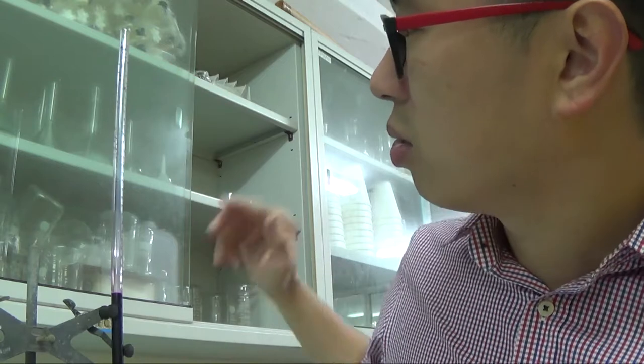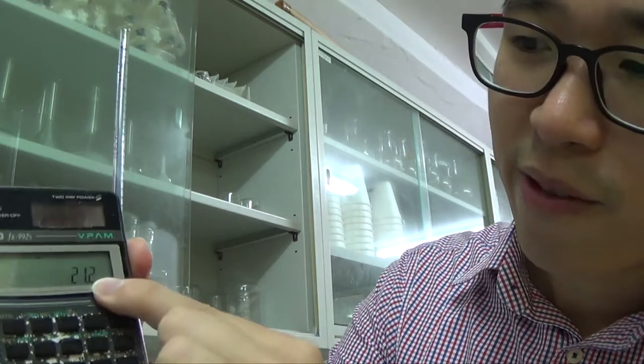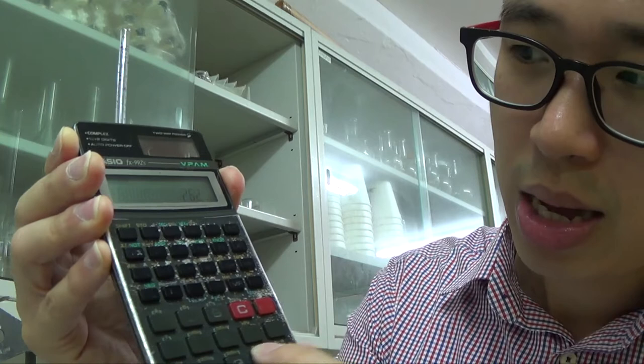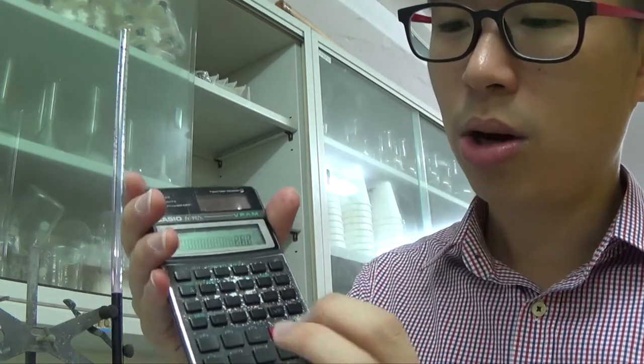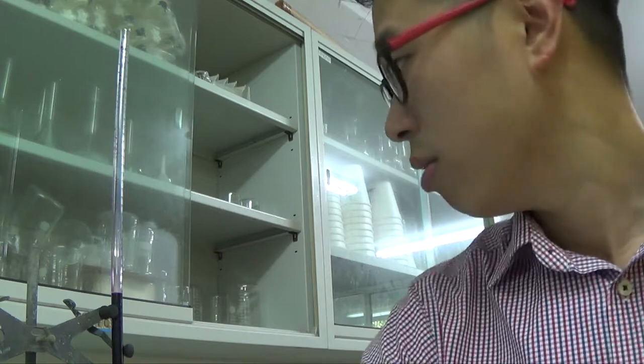So depending on where I start, if I start from five, let's say, I will add 5 plus 21.2. Then once I reach 26 or 26.2, I will slow down. Then I'll go drop by drop, because I know I'm close to my end point. That is the whole point of doing a rough titration, so that you know roughly when to stop, all right? Roughly when to stop. So 21.2, right?